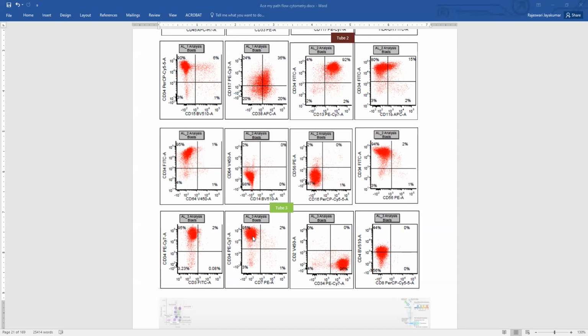Some labs perform cytoplasmic CD3, cytoplasmic MPO, and CD79A routinely, but most labs do not do them because those are cytoplasmic tubes. They just use the screen tubes with the most common markers, and many leukemias can be phenotyped just by those tubes. These add-on tubes are required for some cases where the screen tubes are ambiguous and you need to determine which lineage these blasts are definitely from. That's when they add on those tubes that contain cytoplasmic CD3, MPO, and CD79A.